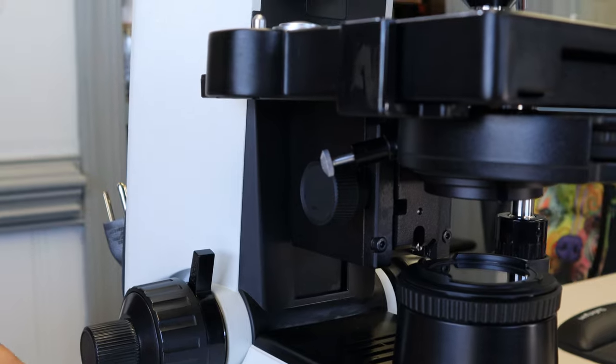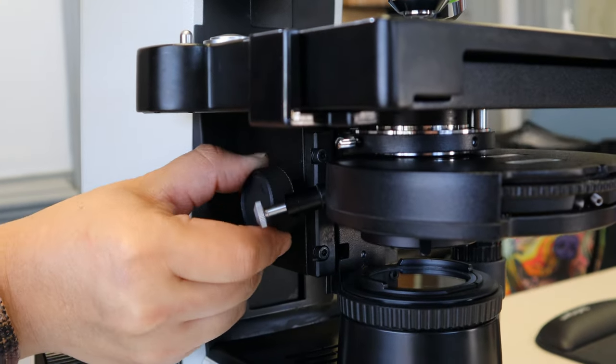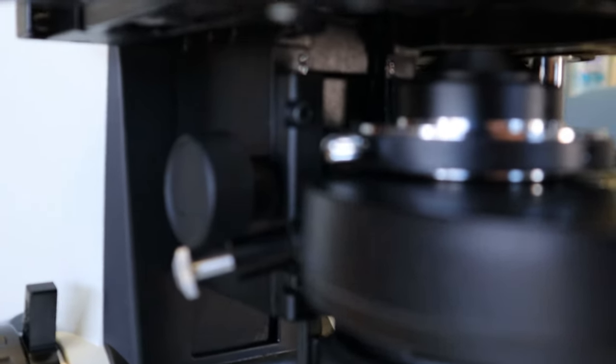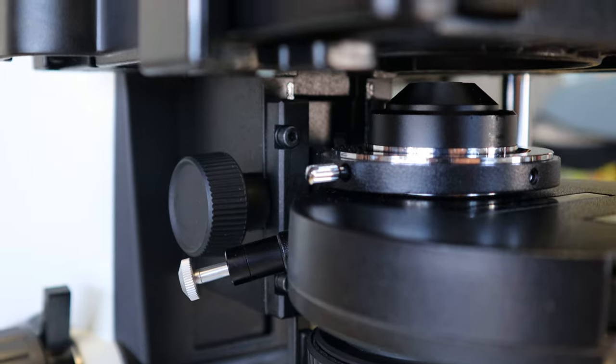Once the condenser assembly is all the way down, it's going to expose a little silver knurled screw with a slot for a flat-headed screwdriver. This is what you're going to use to release the condenser.